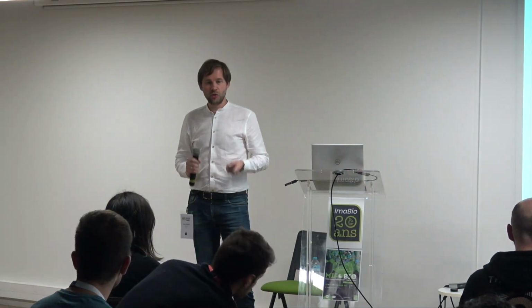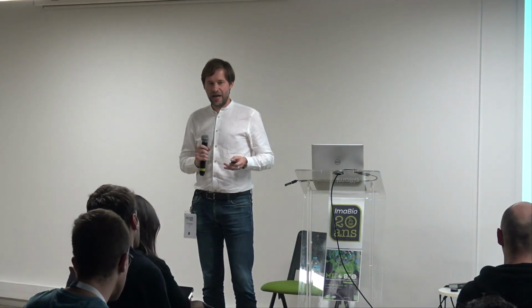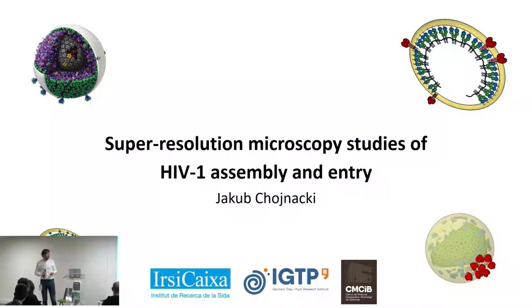What I'm going to do is guide you through super-resolution microscopy techniques, the virus replication cycle, and basically my small contribution to the field, with the goal of convincing everybody as much as possible how super-resolution microscopy really transformed the field of virology and has helped us uncover secrets, or mechanisms, that we didn't know existed before we were able to super-resolve viruses.